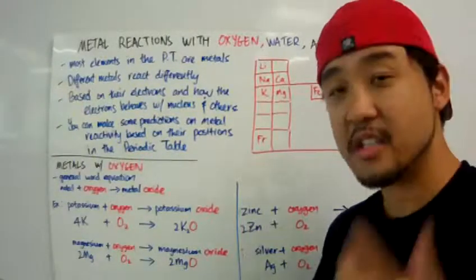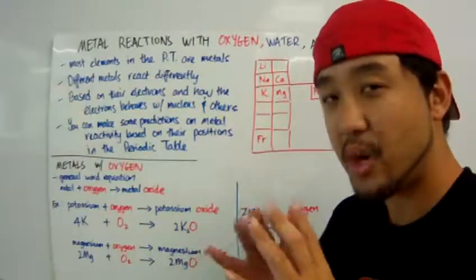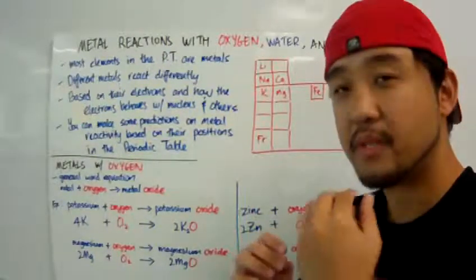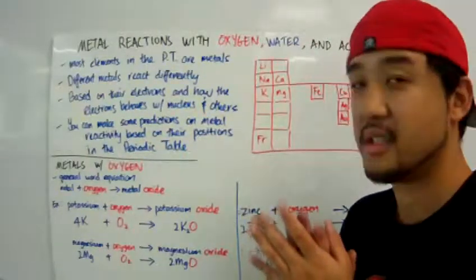Hey guys, this is Mr. Ko again, Year 9 Chemistry, and today's lesson is quite interesting because you get to see different observations of different metals reacting with oxygen, water, and acids.